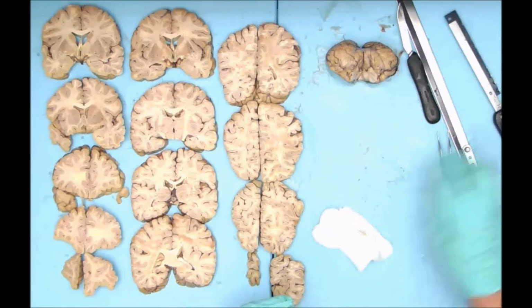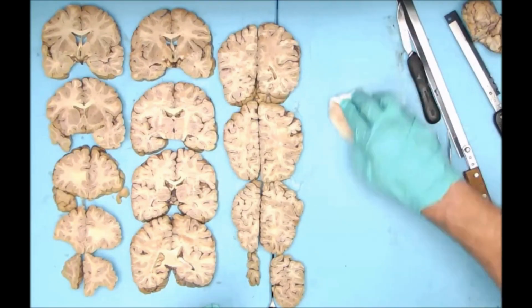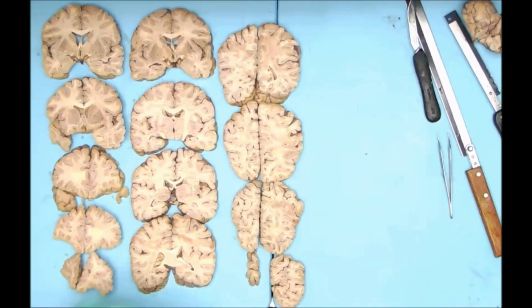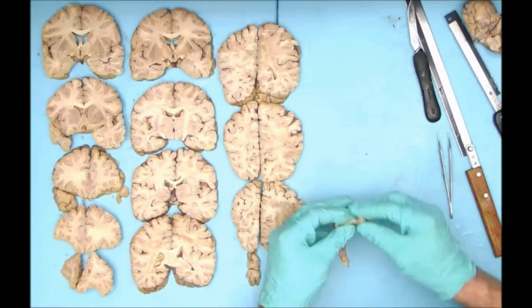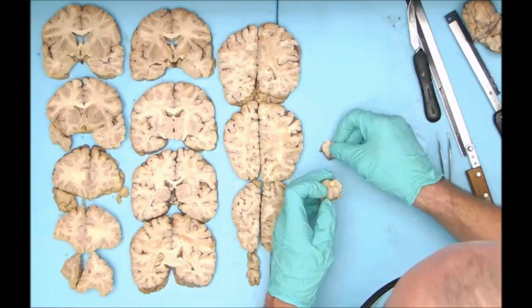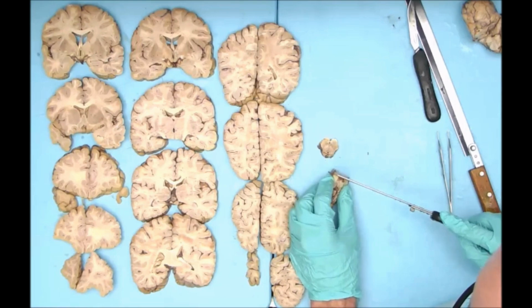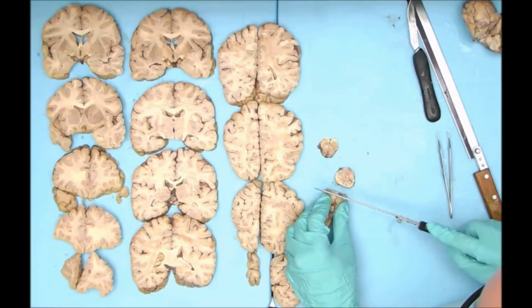And at the end of this, I usually take a photograph of everything and put it into the case. Often the pathologist relies on us to perform these brain dissections, photo document the case, and put it in the case, because they may not be on site. They really rely on us to do a thorough job and document everything.